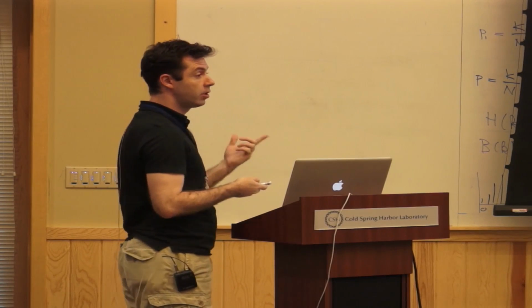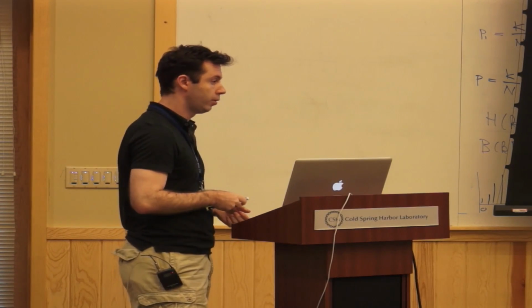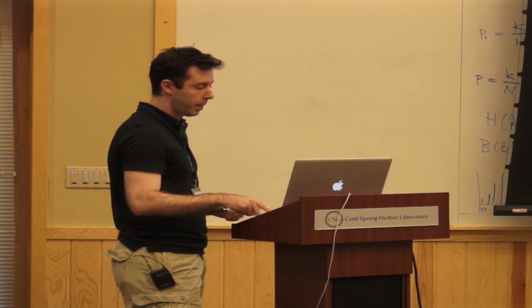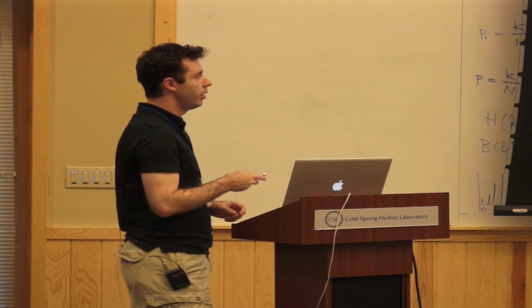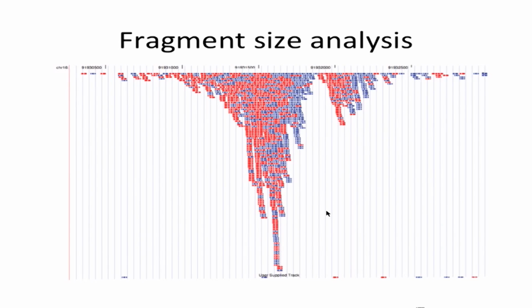But this is a feature that's actually used for identification of peaks. It just works better when you have an isolated peak like this. It probably would work okay in this situation, but if this peak here was closer to this other one, the distribution would be kind of mixed up, and the approaches that use these two shifted distributions would break down.